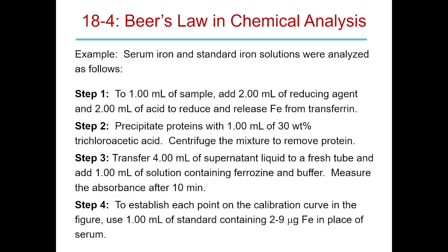But there are instruments that have feeders on them. Coca-Cola uses this. They use a Raman actually to do it. They have a specific peak they're looking at. They have a standard that runs at the beginning, and then they have literally a belt feeder that feeds through millions of bottles a day. What they're looking for is a peak to be a certain absorbance and fall on that, because they're looking at the concentrations of certain ingredients. And if the concentrations are off, then they remake the batch and get rid of it.